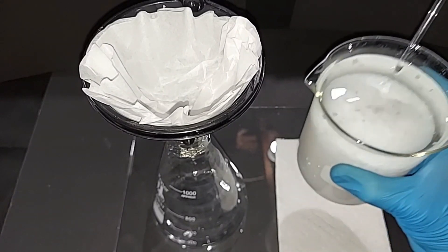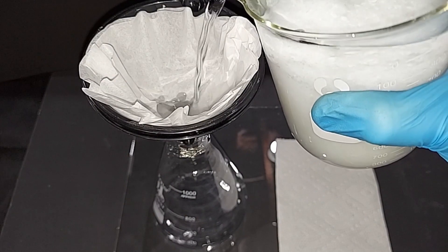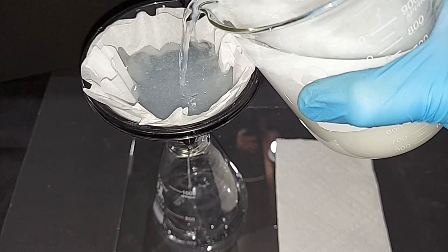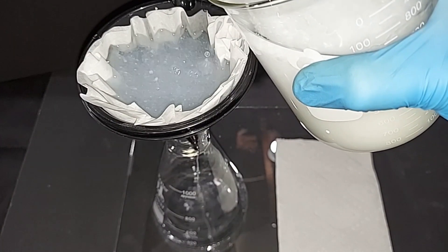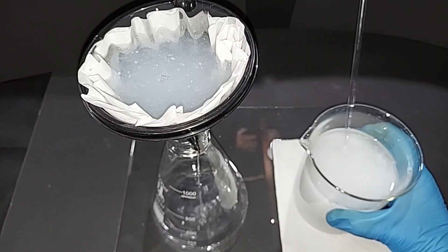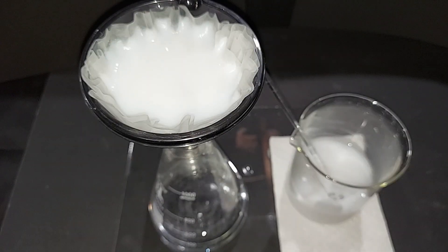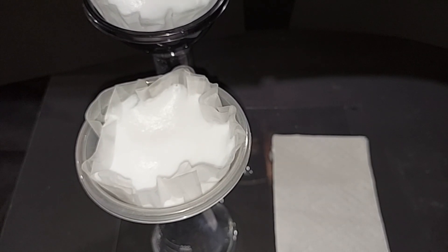Starting to filter this in a one-liter flask — you can see it's already started to sink. This will take some time. The filter paper was getting so clogged I had to use a second flask to speed things up. Now that most of the water has dripped through, I'm going to take the filter paper out and start the drying process.